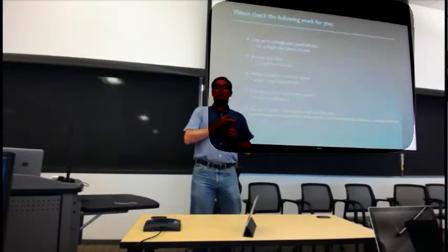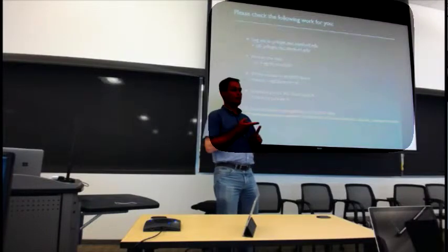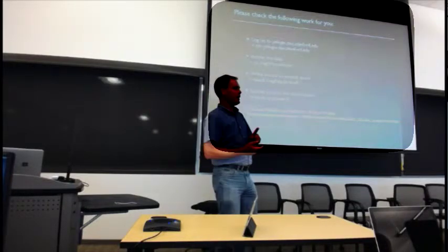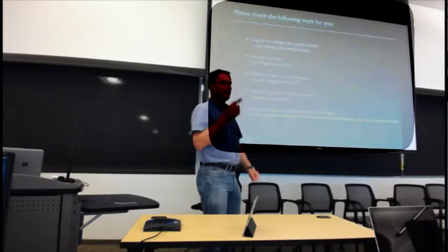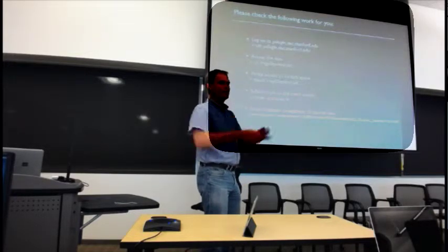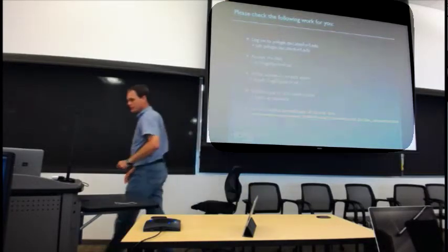By default, the PI of the experiment can do all of those things because they are the gods, so they conveniently forget that everyone else needs to have this access granted. So you usually come to the experiments and say, oh yeah, you need access. You can sort it out before. It's really easy to do on the web, but if you can't get at the data, you're screwed.